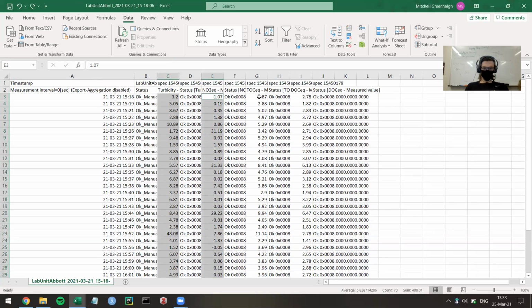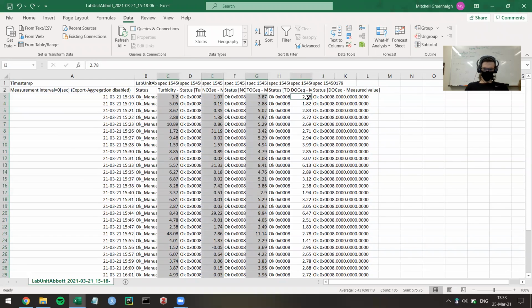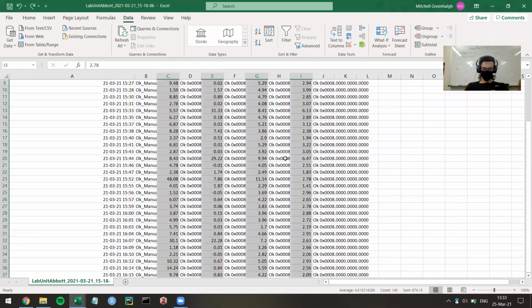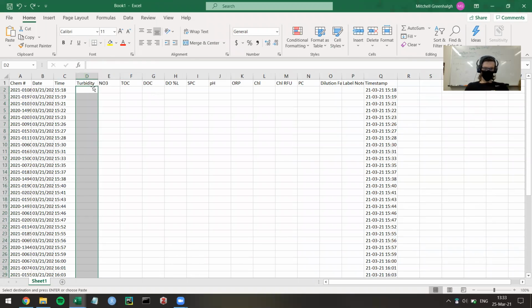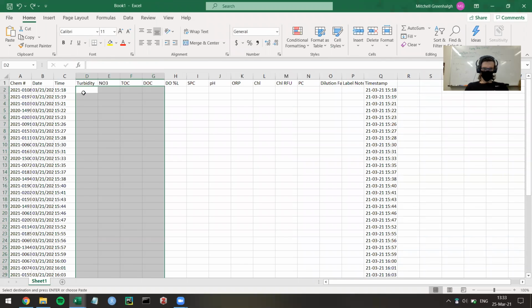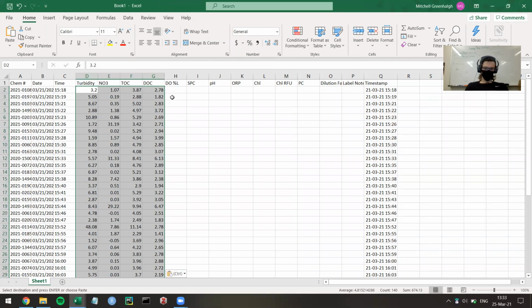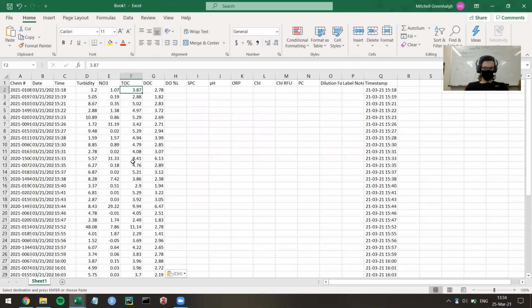And then you just repeat that, hold Control and click, then Control Shift down, then Control click, Control Shift down, and that has all the columns that we need. And then you can press Control C to copy, and you come over here. Even though there are different columns in between these ones right here, when you paste it in, it automatically truncates them to all being right next to each other. And so that gets all of our values into the spots that we need.